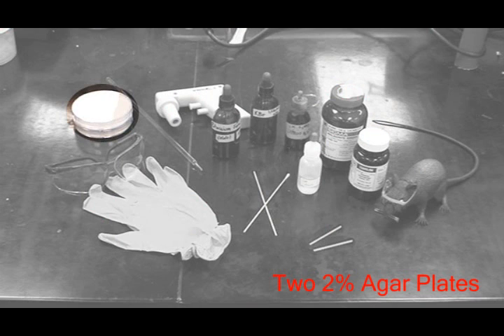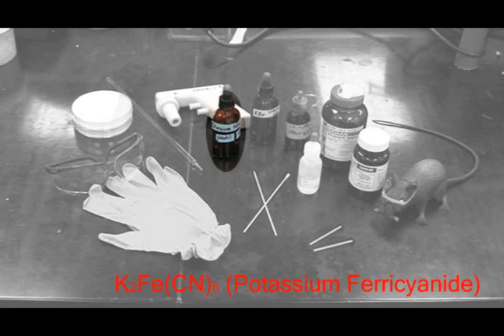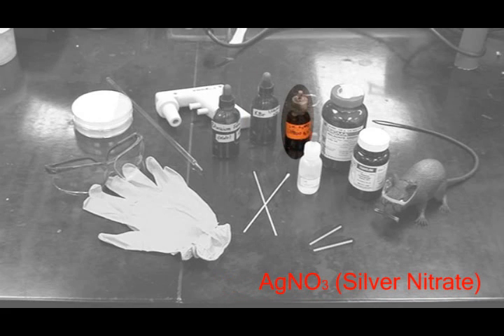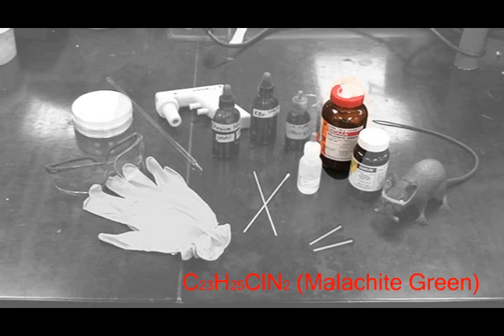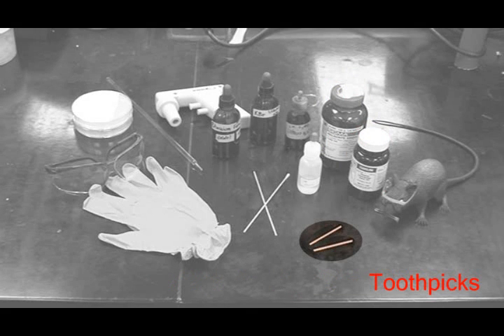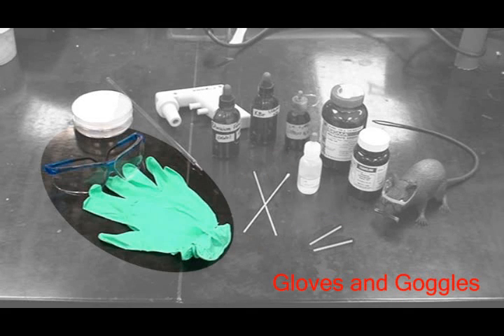you will need two 2% agar plates, a 5 mil pipette, a pipette bulb, potassium ferrocyanide, potassium bromide, silver nitrate, sodium chloride, malachite green, potassium permanganate, toothpicks, cotton applicators, gloves, and safety goggles.